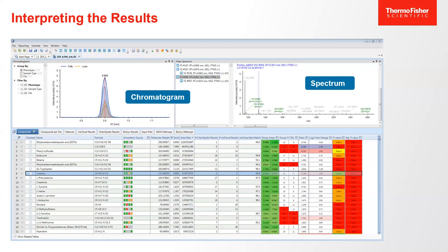That chromatogram came from a spectra. It came from a particular chemical above the noise being plotted over time by the software. The real question, though, is, what do we do with that peak? The first question we ask is, what is it? So I'm going to talk about different ways that we can identify that LC chromatographic peak and use its area for actual biology. I'm going to talk about what kind of levels of identification we have available to us.